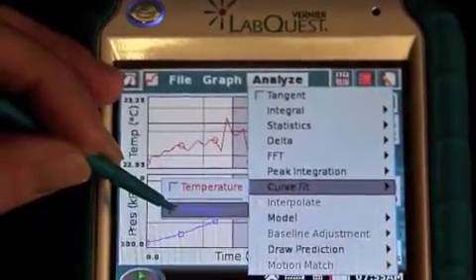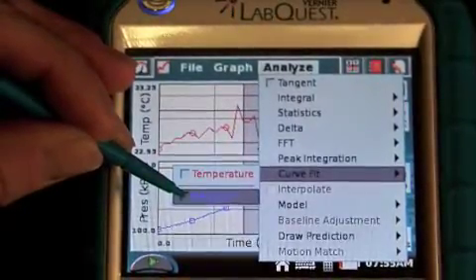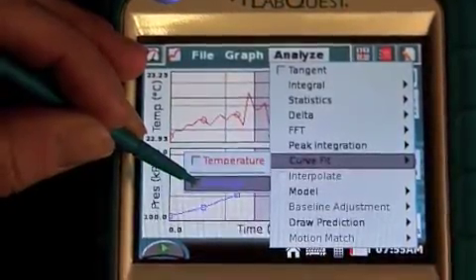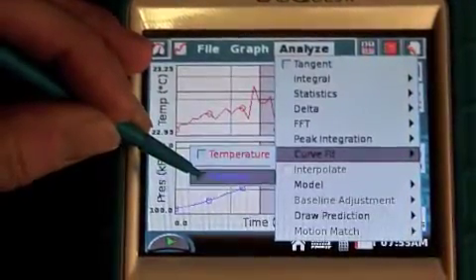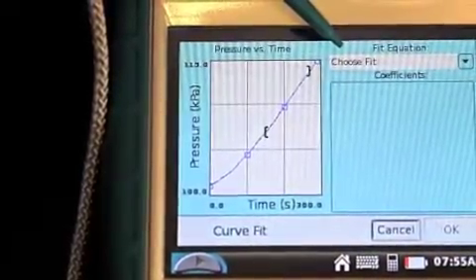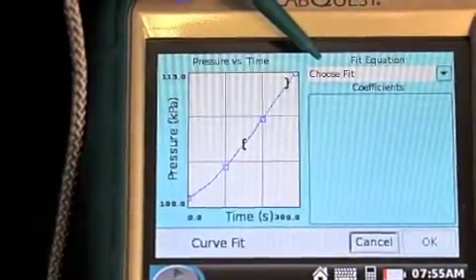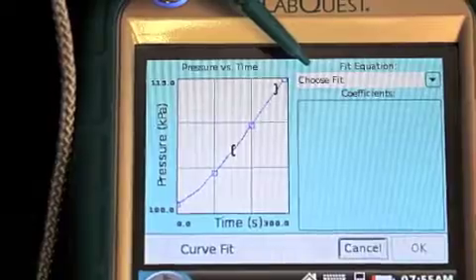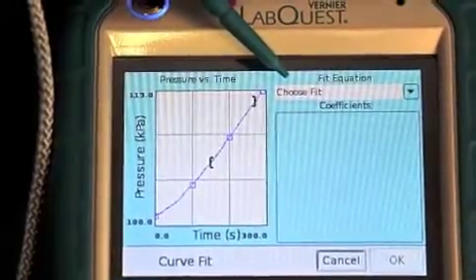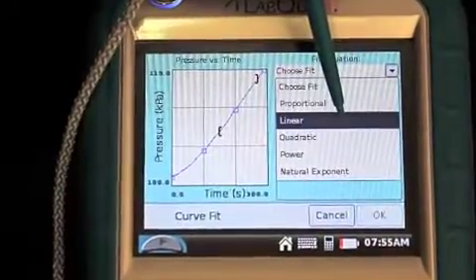So again, we're going to go up to the Analyze menu, and this time we're going to pull down until we reach Curve Fit, because what we want to know is the slope of that line. Pull your stylus to the left and select the pressure sensor. Now the LabQuest is going to ask you what kind of mathematical operation you want to try to analyze this graph with. Well, you want to know what the slope is, so you're going to tell the LabQuest to choose the fit that is linear for this choice. So under Choose Fit, pick Linear.